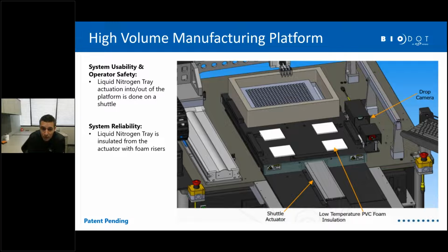Safety is a major consideration, and you want to minimize any transfer of temperature to the automation.